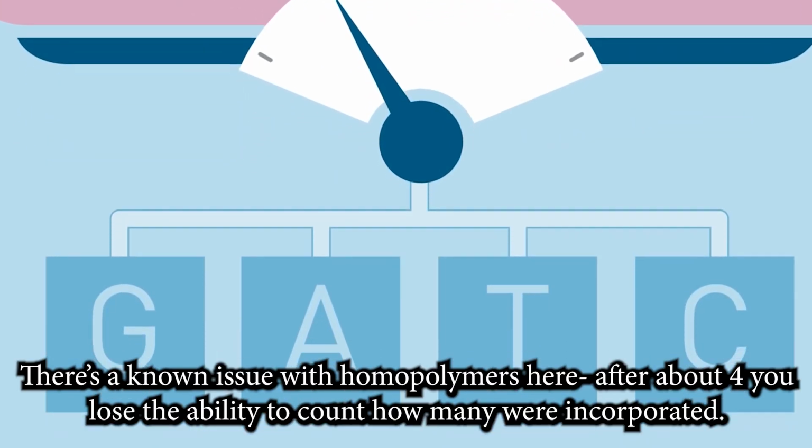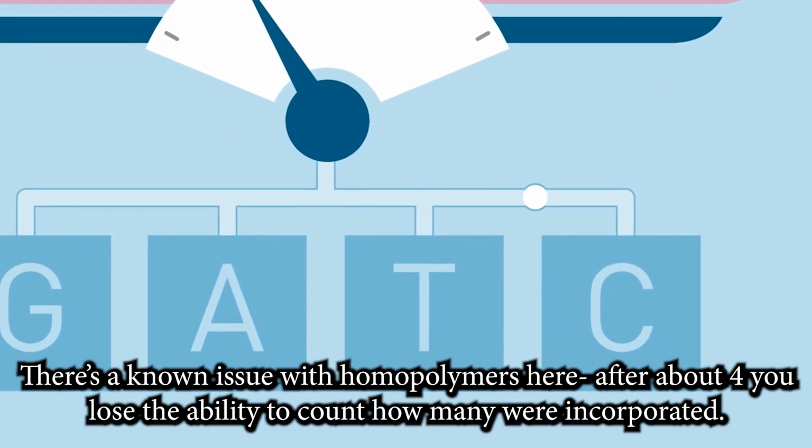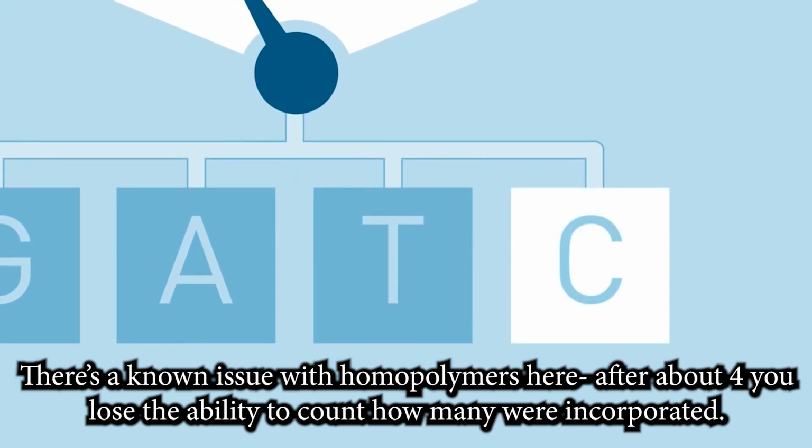There's a known issue with homopolymers here. After about 4, you lose the ability to count how many were incorporated.